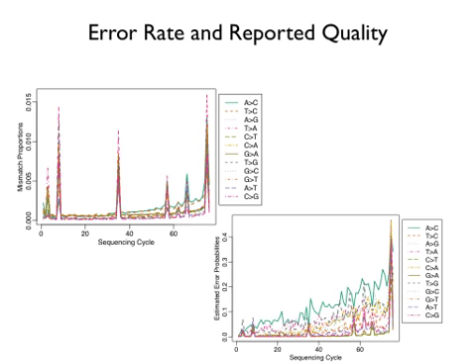And this is a particularly bad run, but it's quite simple to make. So here's how you make it. You take a few reads. Don't take them all. Take a few, 10,000, 100,000, and you map them to the genome using something that is very liberal, like maybe Smith-Waterman, or if that's too slow, Bowtie, permitting a lot of mismatches. So you can get things that have a lot of errors matching.